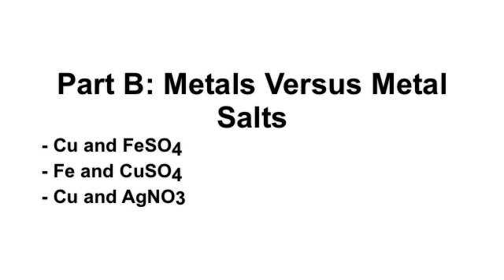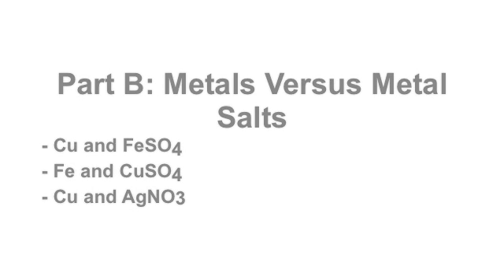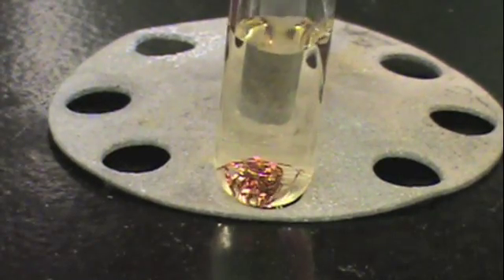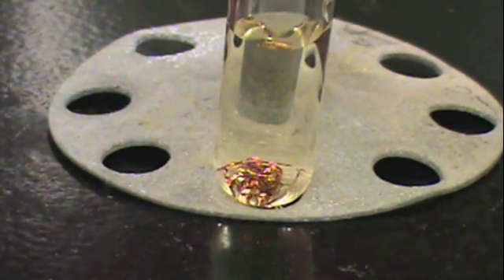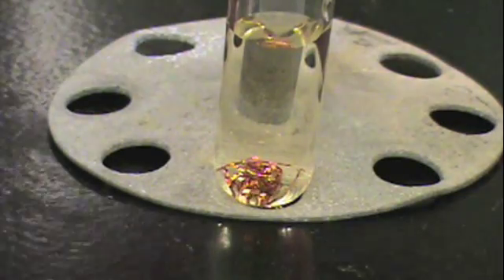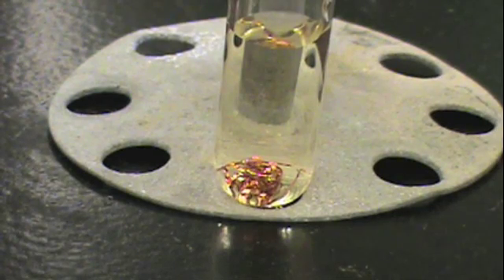In part B of this lab, we will react different metals with metal salts. In the first part, we will react copper with iron sulfate, and we see that even after several seconds, there is no reaction between the copper and the iron solution.